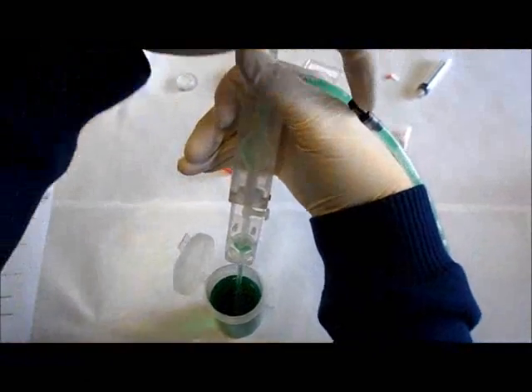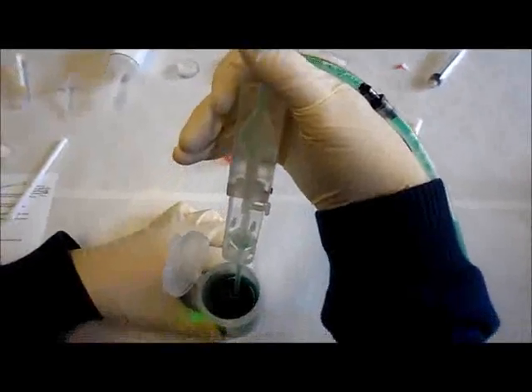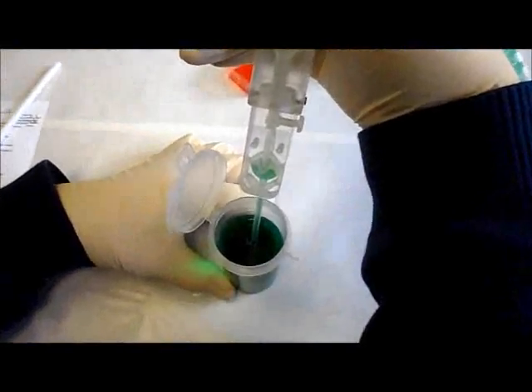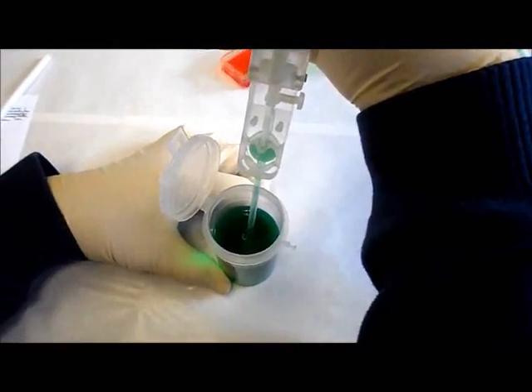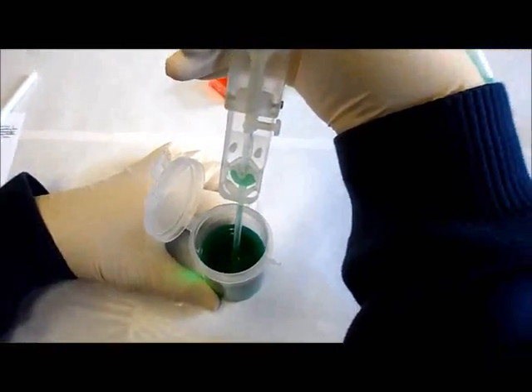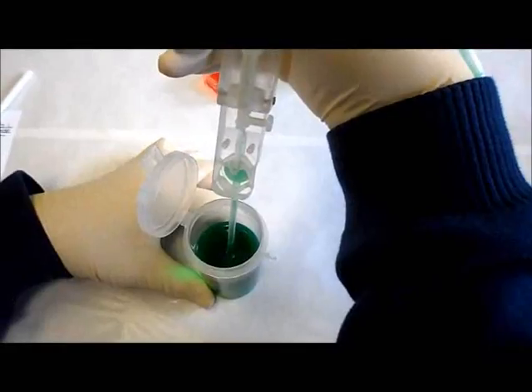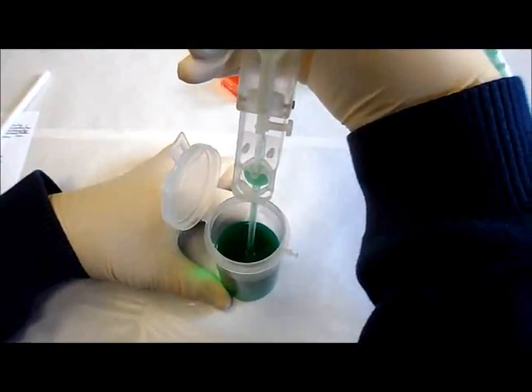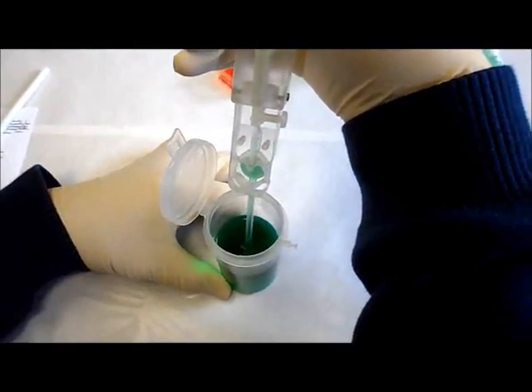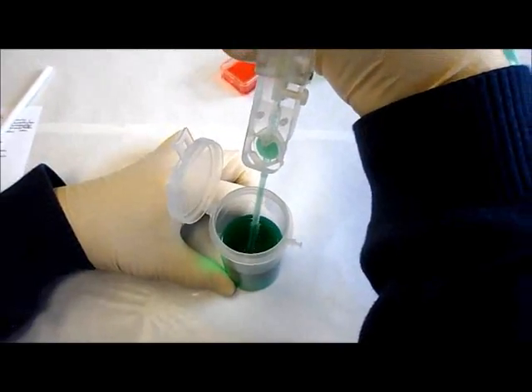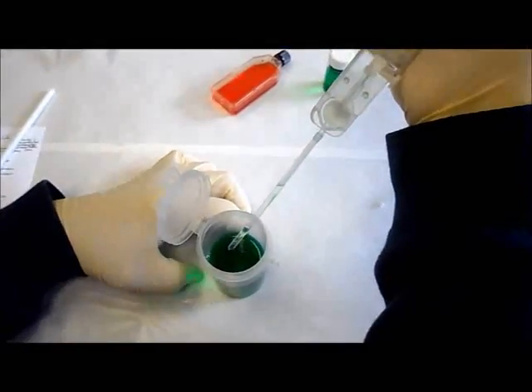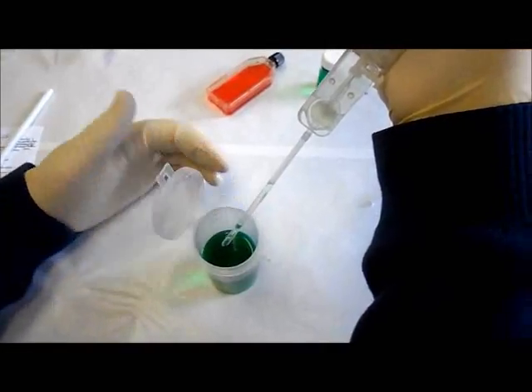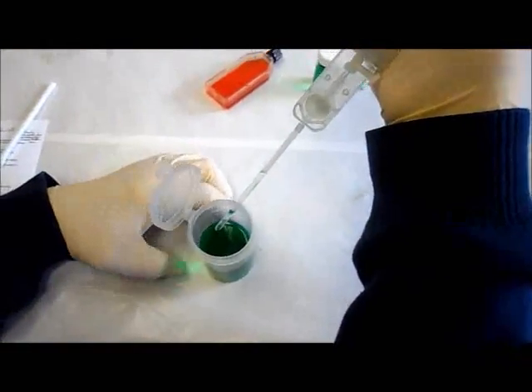As you can see, the fluid passing out of the line, this process for filtration separation can be utilized for either cells or capturing bacteria, harvesting, concentrating microparticles, or dealing with any kind of an insoluble reaction product, precipitate for instance, that you want to analyze after it's been concentrated in the cartridge.